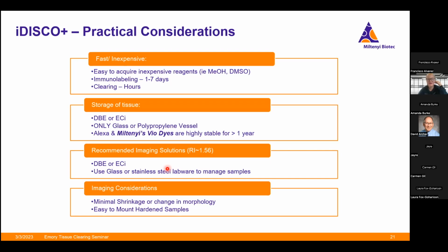So that you're not putting the ECI bottle directly on top of the counter, because it will mess up the finish and leave these ugly looking stains that cannot be removed. And you'll find when you're working with this, especially ECI, it just tends to leak. I don't know how it does it, but it crawls up the side of the walls of the cuvette. It will run over. So just keep in mind that wherever you place this, it will mess up the finish of your lab benches.